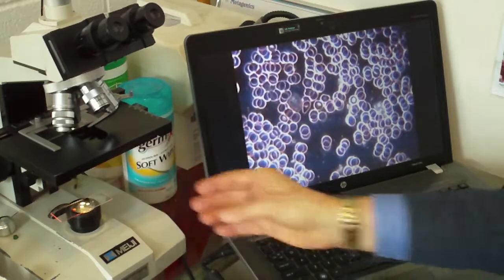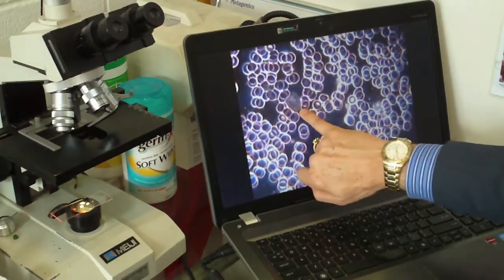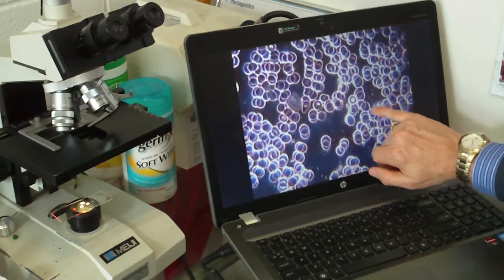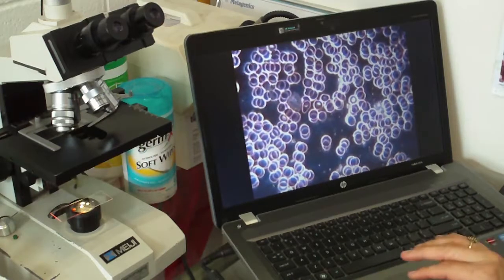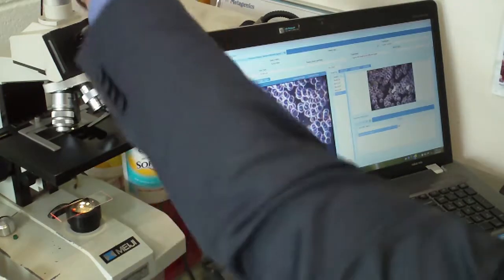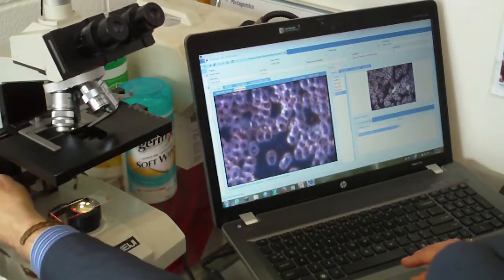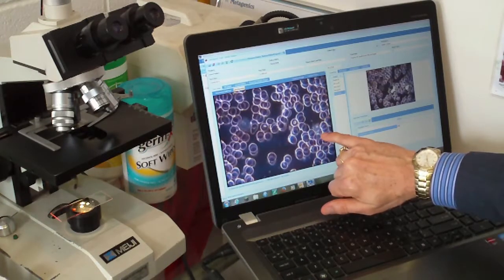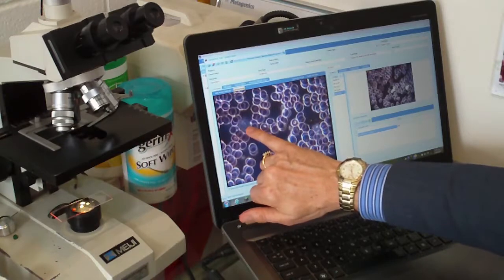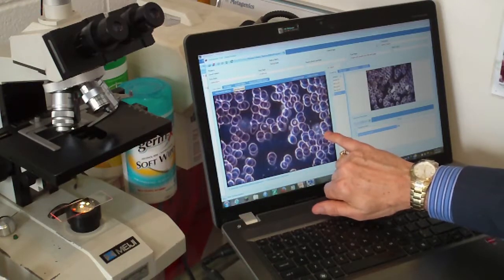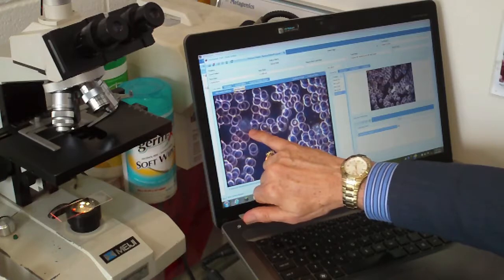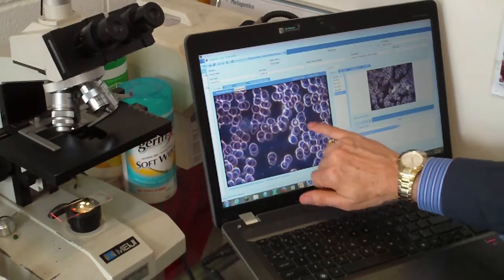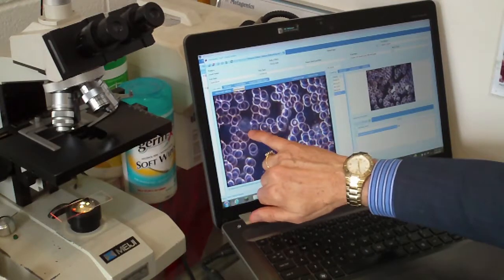Okay, now here's an interesting one. If you look here, that's a healthy lymphocyte. This one is an unhealthy lymphocyte. It's actually a combination of platelet aggregations by the looks of it. Let's have a closer look. Because some of these signs look incredibly similar, and it's the skill of the operator. No, it's definitely a lymphocyte. So this one here is an infected lymphocyte with viruses. The fact that this one close to it isn't means this is historical. Because these have a lifespan of about 60 days, 55, 60 days. So this will most likely be an older one, and it looks older. It's not as well formed. This is a much fresher one that's come out of the bone marrow, probably the last, I'm guessing, 10, 15, 20 days.